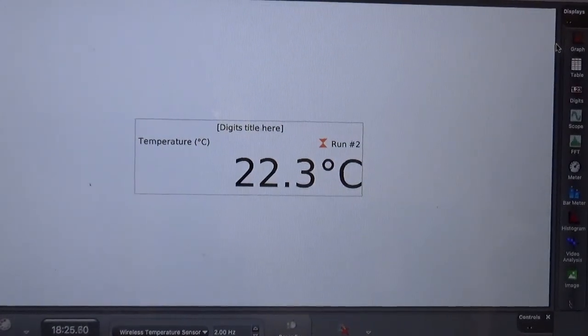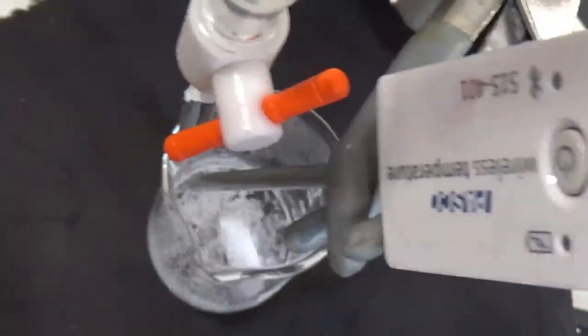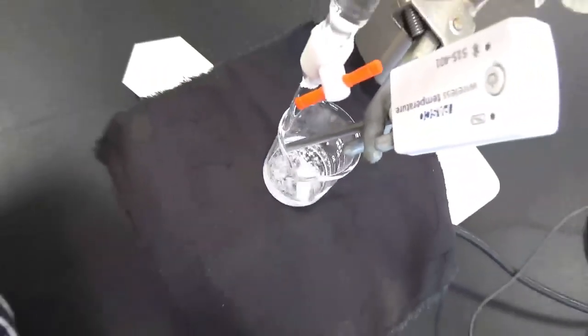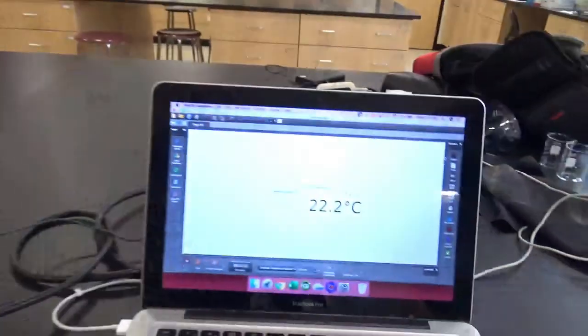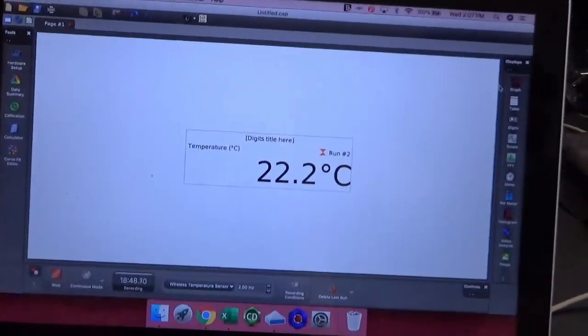Is there any angle we could get that? From the top, maybe. Oh, yeah. Oh, yeah, look at that. Really see individual crystals. Glad I did that. Looks like fewer than before. Yeah. Oh, thank you.